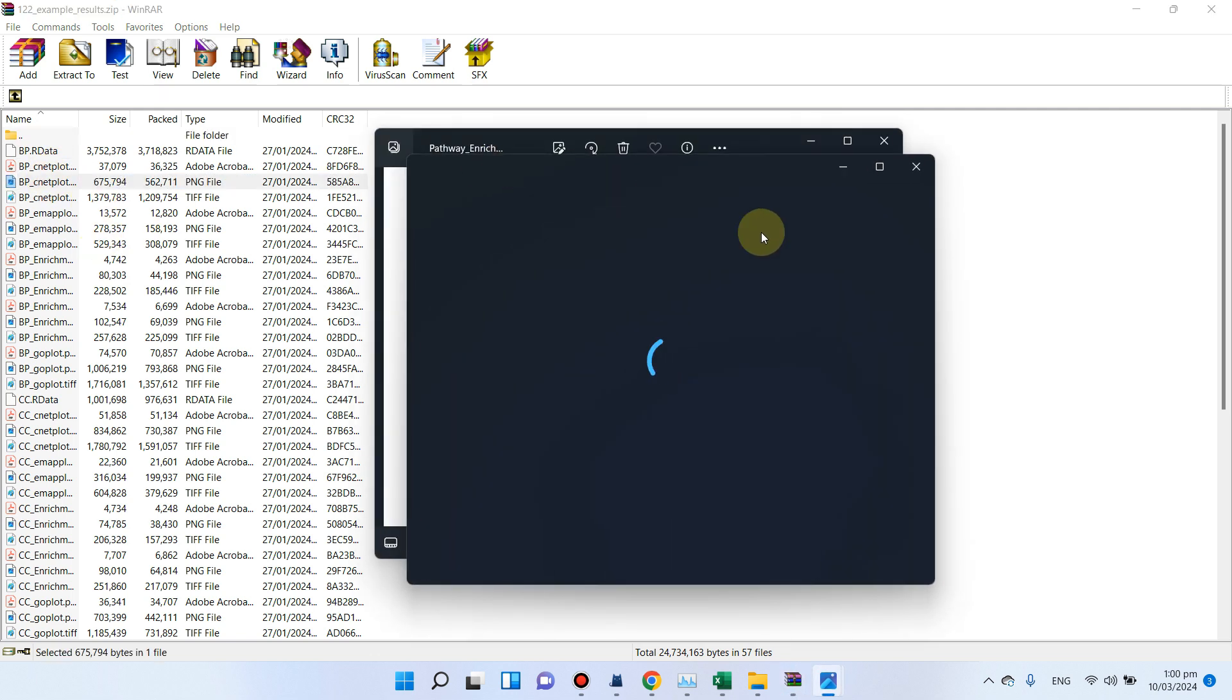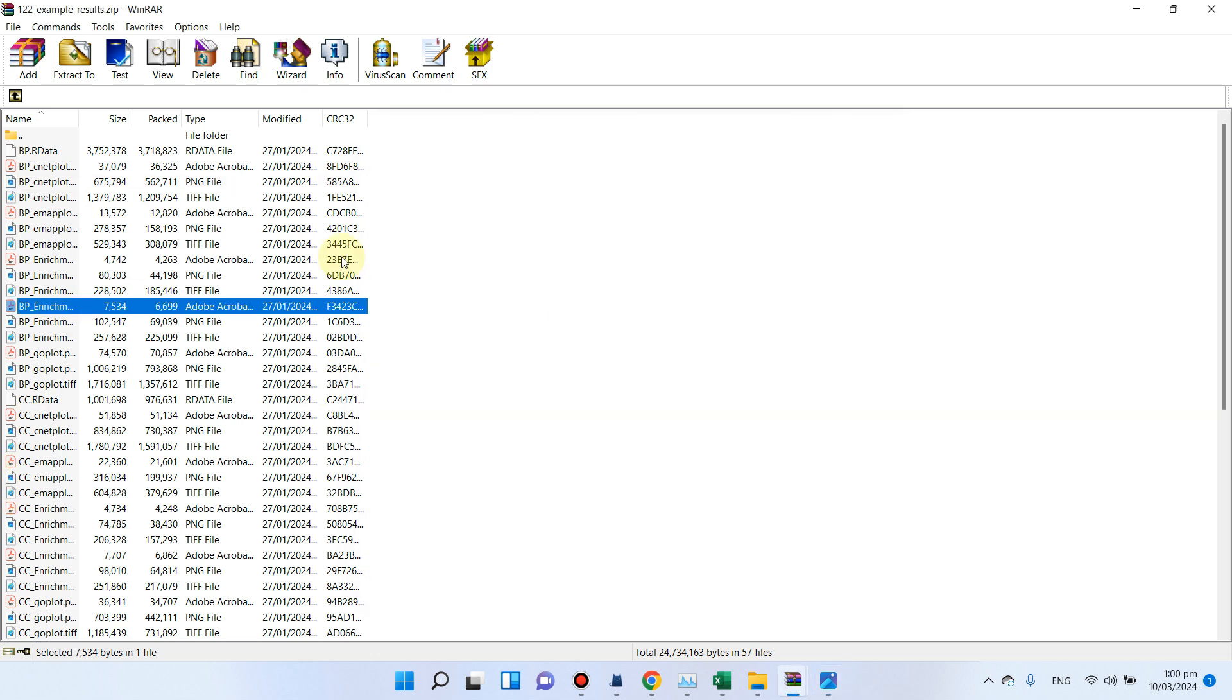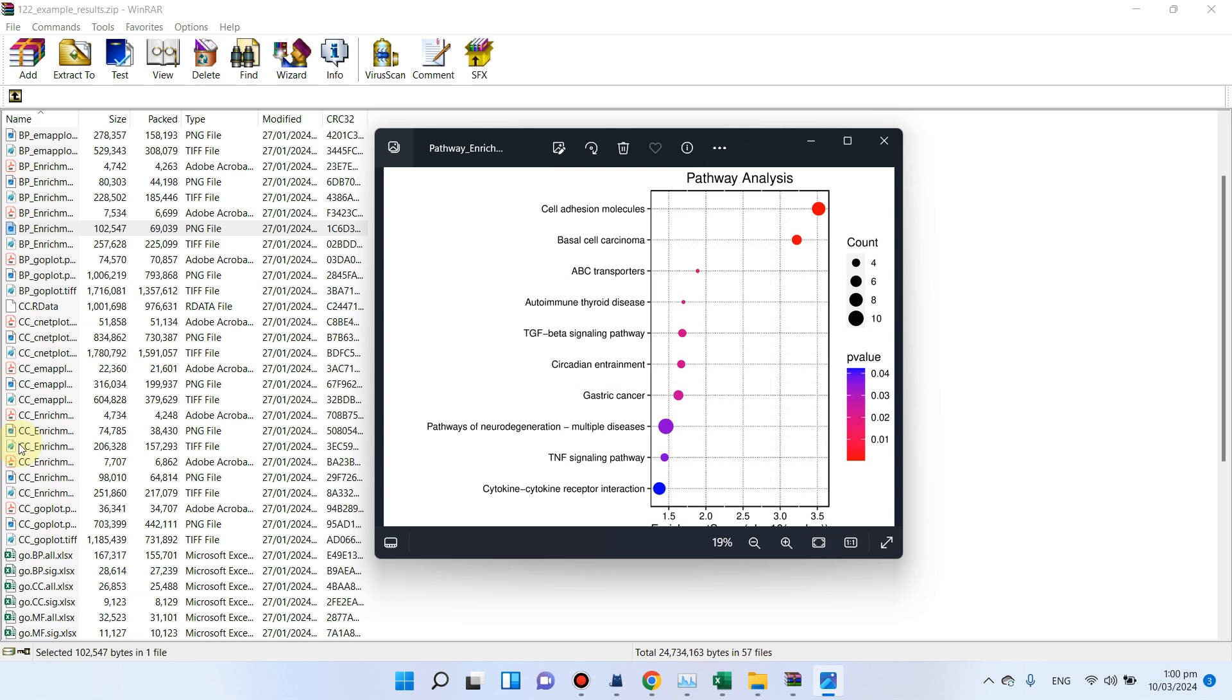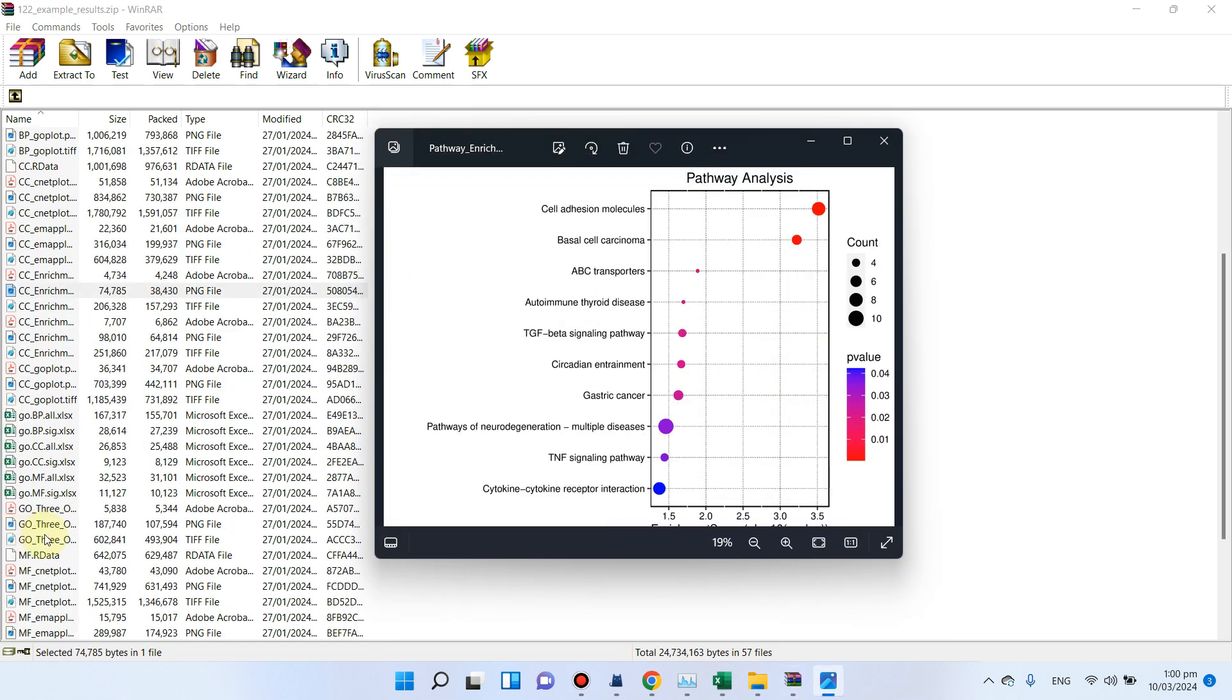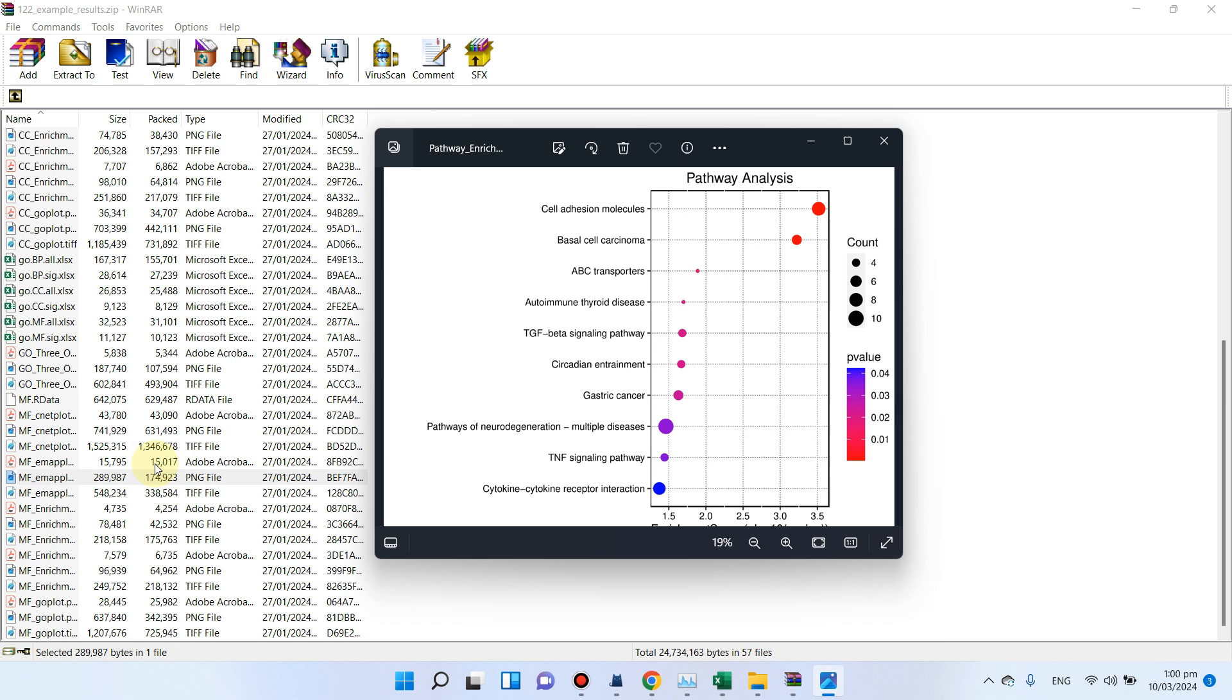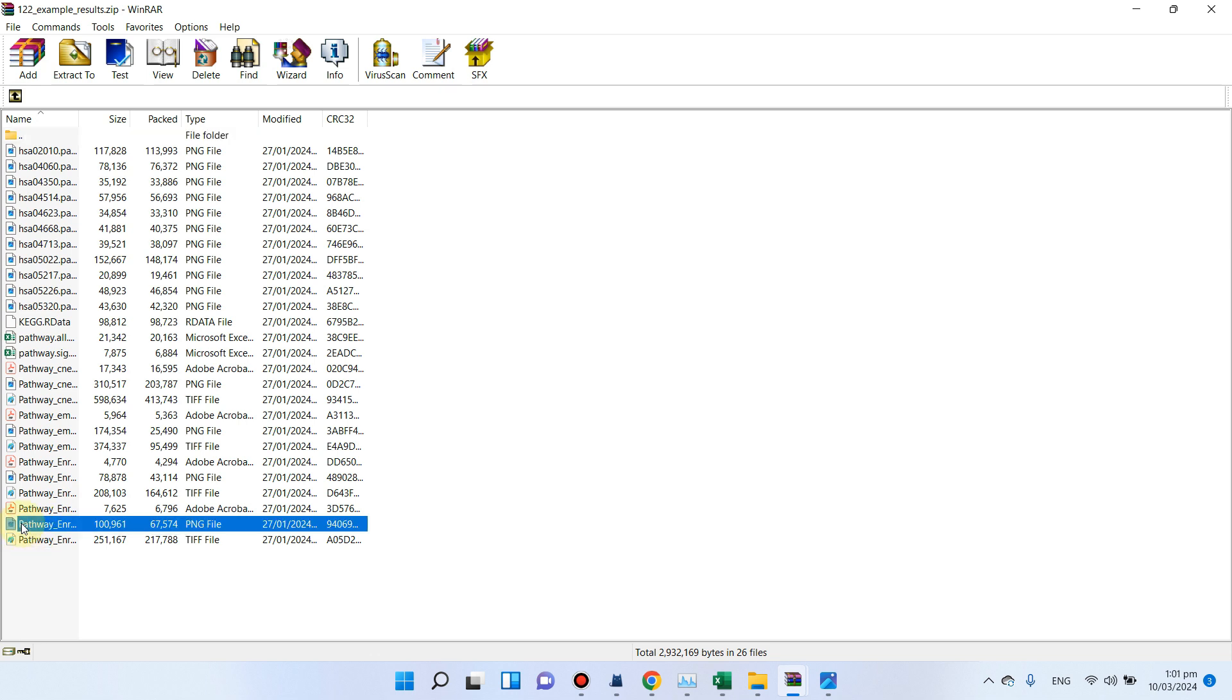You can see in this we have path view. We have for biological processes, and we have biological processes. Similarly, we have for cellular components, and we have all the Excel files, and we have also for molecular functions.